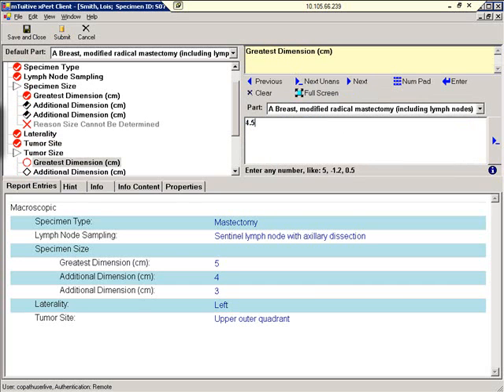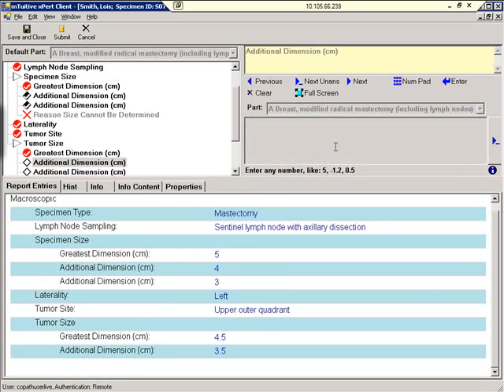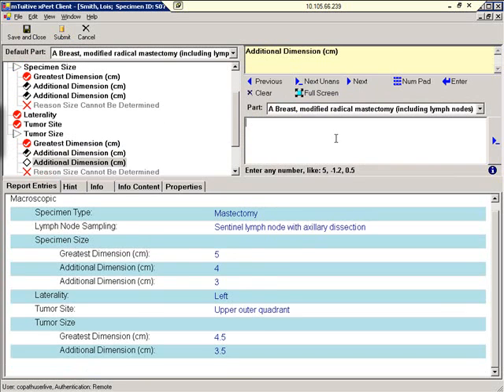Greatest dimension. 4.5. Additional dimension. 3.5. Final additional dimension. 3.5.